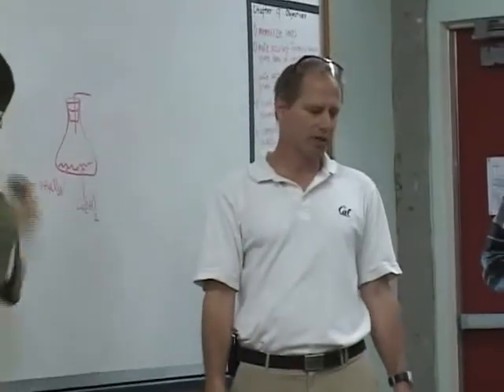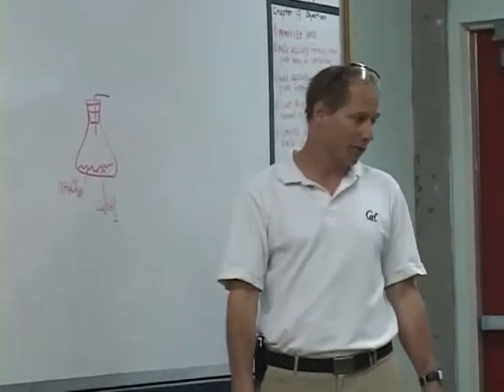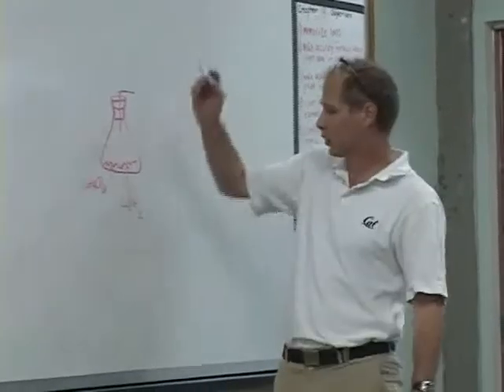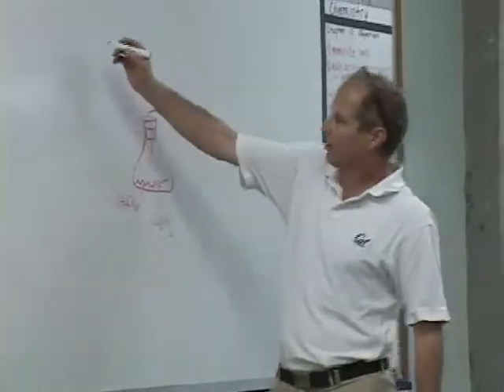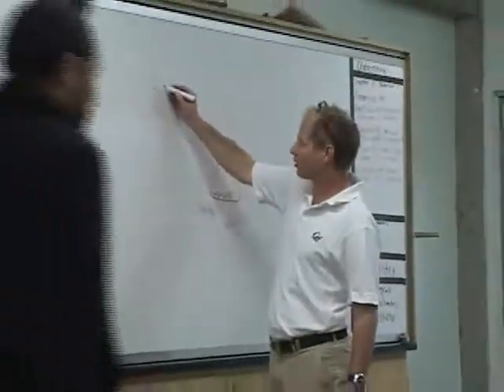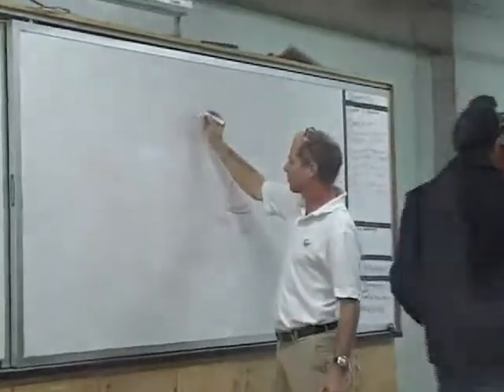Today's demo is going to talk about the solubility of ammonia in water. And the first thing you're going to see is the preparation of ammonia gas.